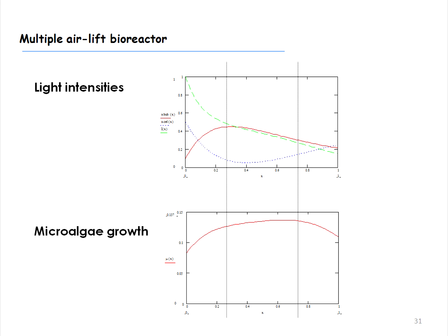And we can calculate those same production regions, okay? So you see that very close to the light source you have photoinhibition, so you have a smaller useful region. Far away from the illumination, you don't have enough light, and you have this useful region for cell growth.